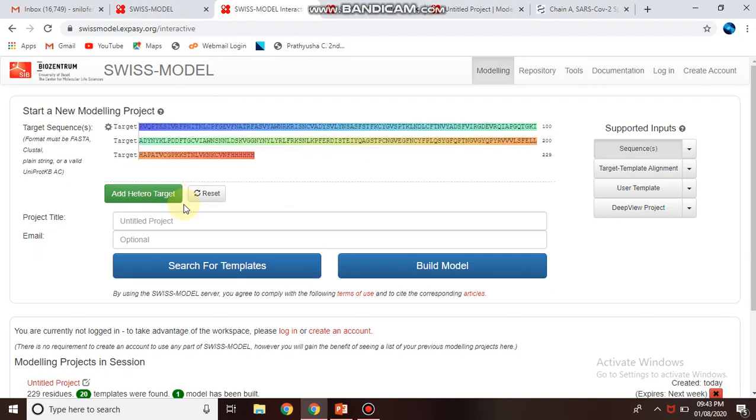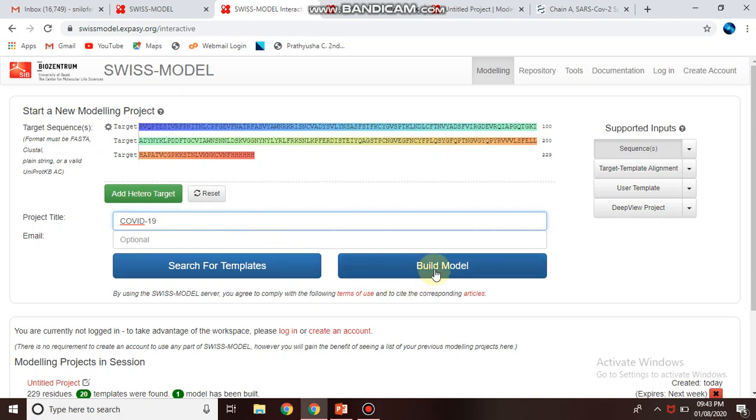You can simply copy-paste your sequence in FASTA format here. It will validate and you can give your project a name, for example COVID-19, and directly click on Build Model. It will search the template and build a model.